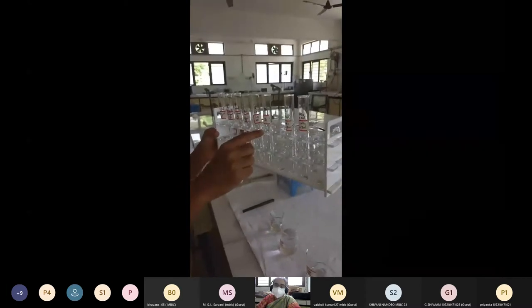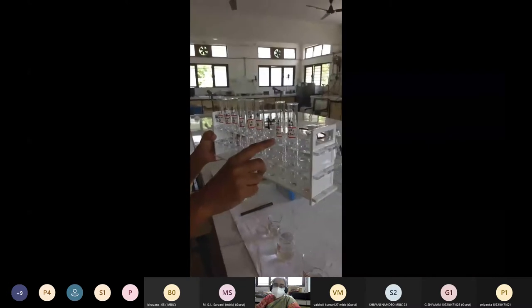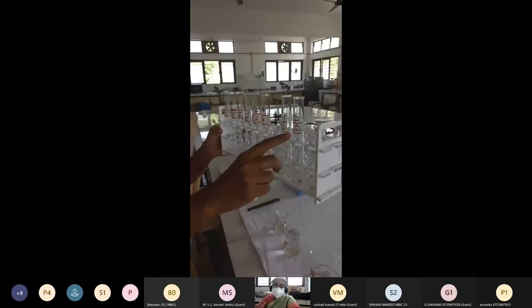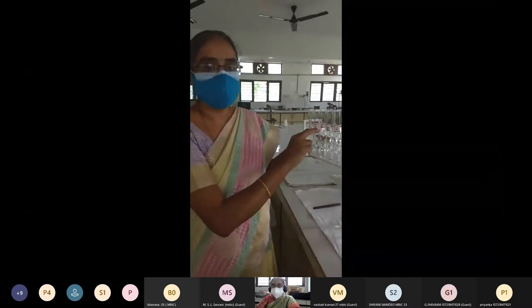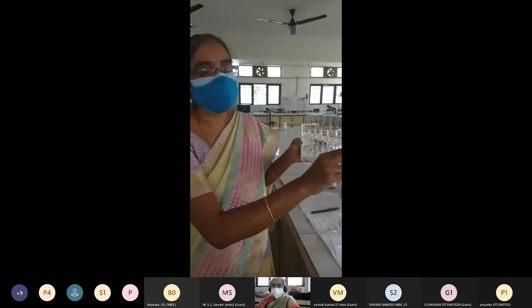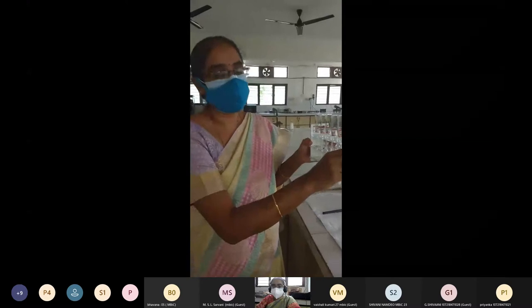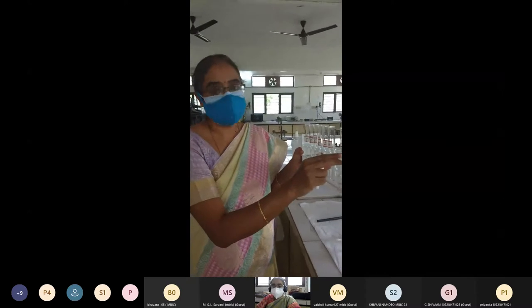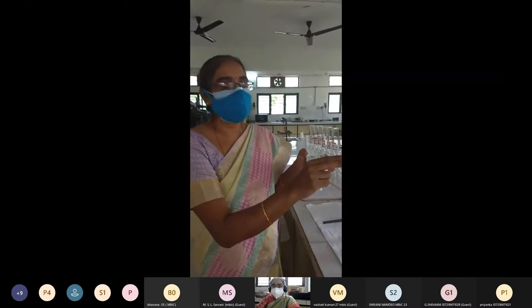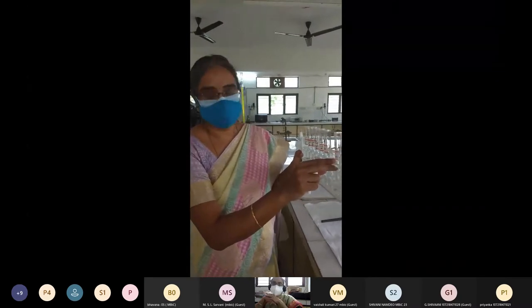We also require the unknown solution whose concentration we need to determine, along with distilled water. We have taken a series of test tubes labelled 1 to 5, with volumes of standard solution ranging from 40 to 200 micrograms per ml concentration. The blank tube contains only 1 ml of distilled water. From the unknown, two aliquots of 0.5 ml and 0.7 ml are taken into separate test tubes. Once the standard solutions and unknowns are pipetted, make all tubes up to 1 ml with distilled water, then add 4 ml of Orsenol reagent, shake thoroughly, and place in the boiling water bath for 20 minutes.